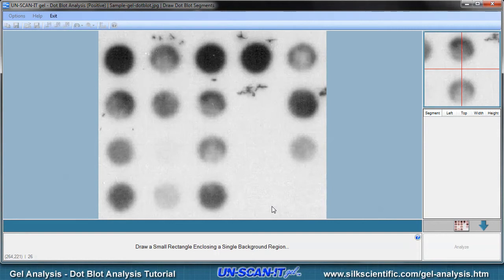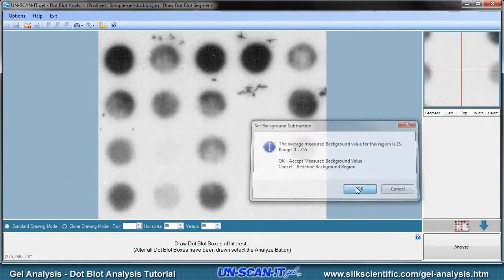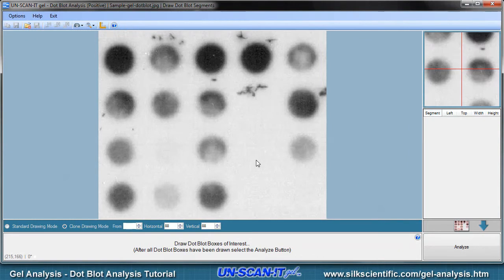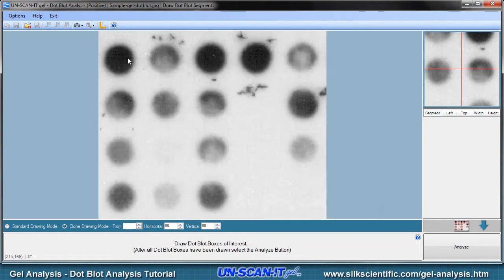The next screen is where you will draw the segment boxes of interest on the gel image. General instructions will be presented at the bottom of the screen. However, before we draw the segment boxes, we will first define the background by drawing a small rectangle enclosing a single background region. You can use the zoom toolbar option to increase or decrease the zoom level of the main image. Since we are in clone drawing mode, use your mouse to draw a segment box encompassing the entire single dot blot in the upper left corner of the image.